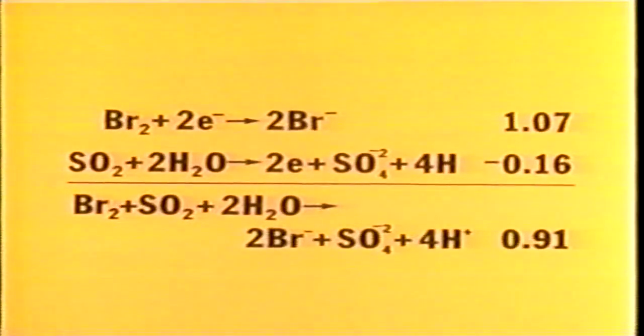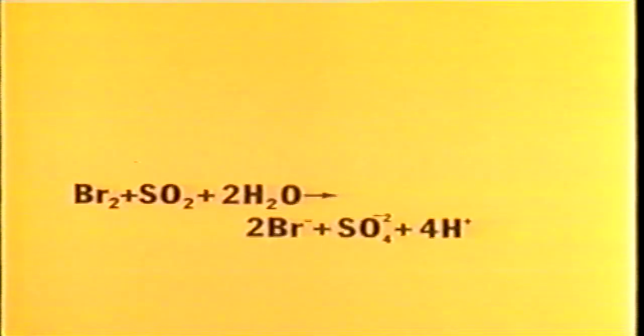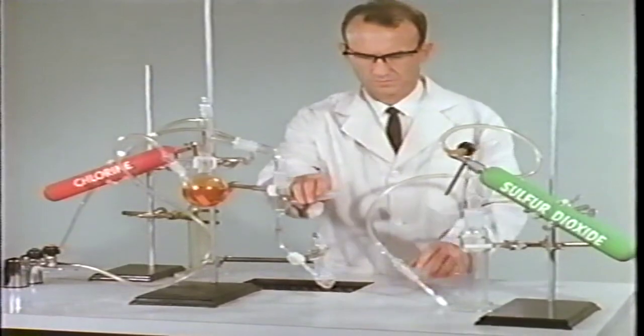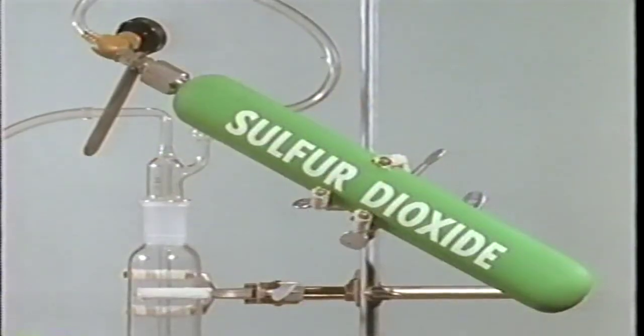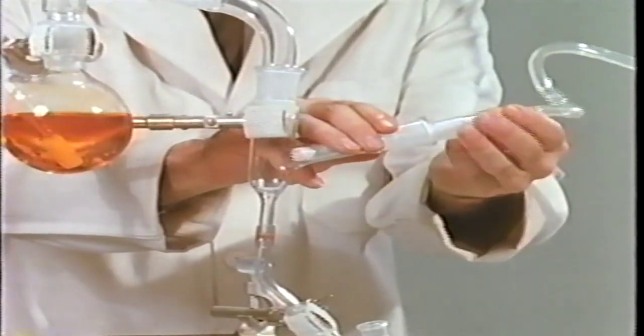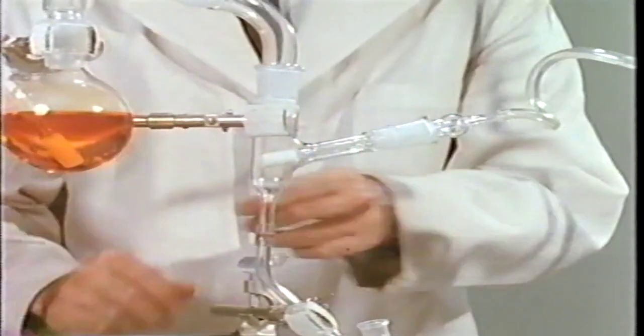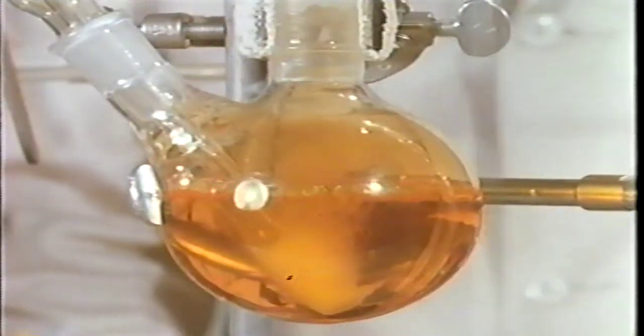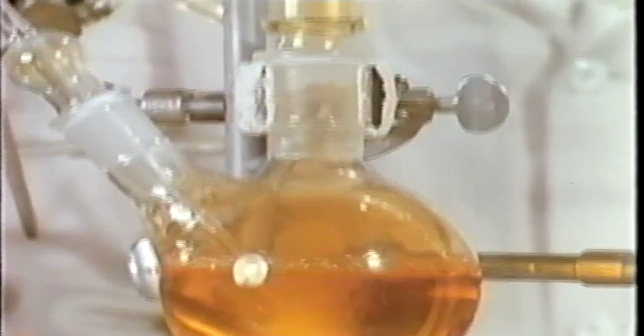We expect that an aqueous solution of hydrogen bromide will be produced, so the gaseous bromine, when swept out of the seawater, can be concentrated as aqueous hydrogen bromide. We have modified the apparatus to attempt the reduction of bromine with sulfur dioxide. The compressed air is again turned on, and elemental bromine is swept out.